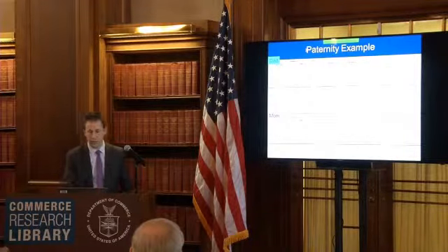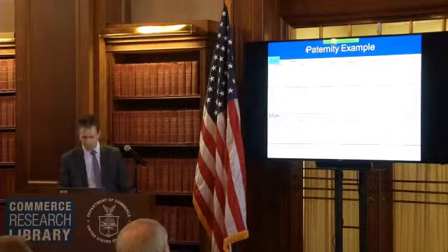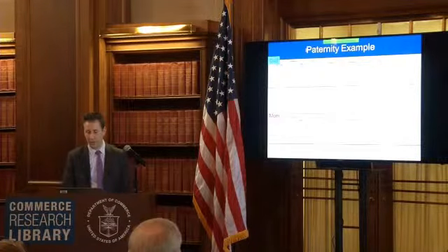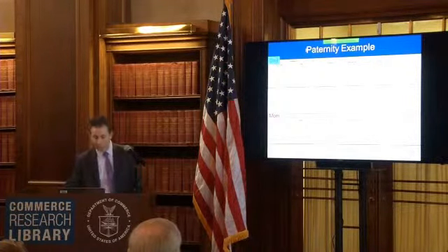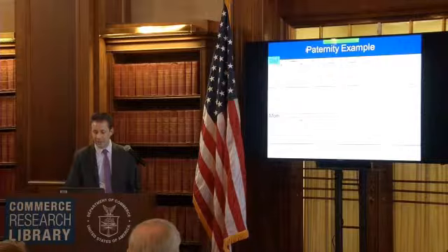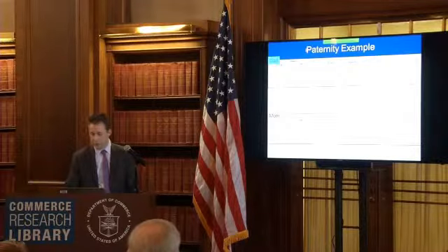So here's a nice example, a paternity example. There's the father and the mother, and you can see from this example, I'm just showing a few of their markers, not all 13 or 20. It gets kind of complicated to see, but these two people luckily are not related. You can see that they have different markers. There's an 18 here, there's a 14, 17 here. So at most of these, there's a different allelic state.